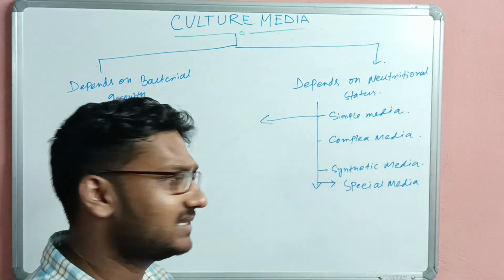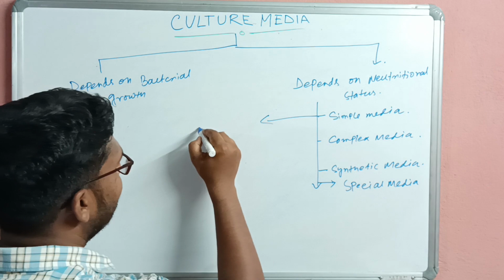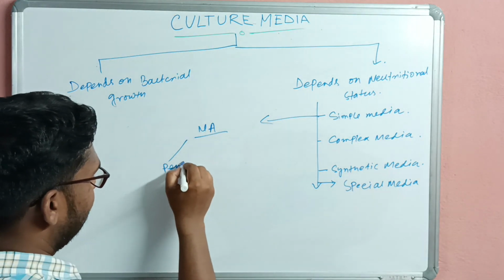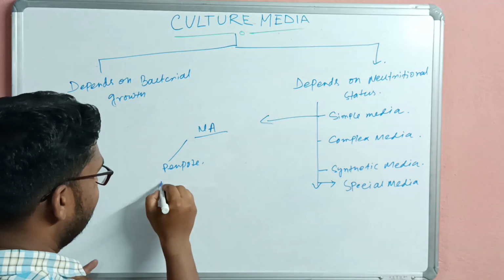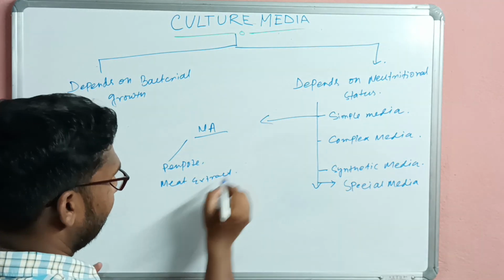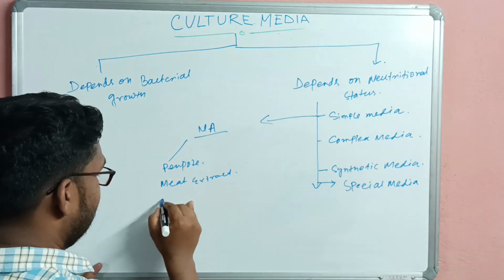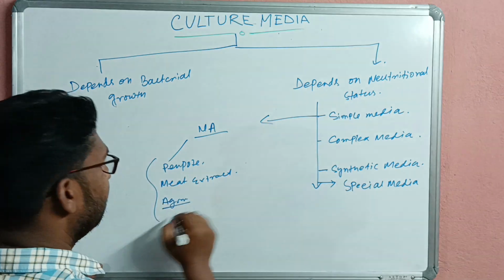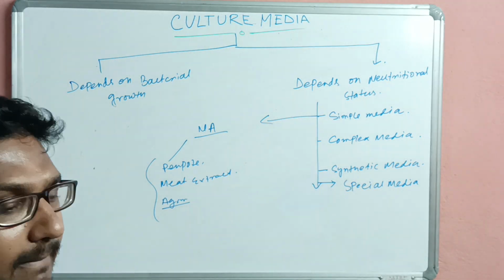Inside this is, like the nutrient agar, peptone, meat extract, and agar powder. Okay, this is the very simple media.